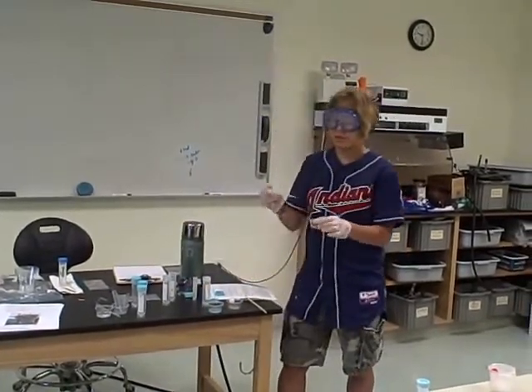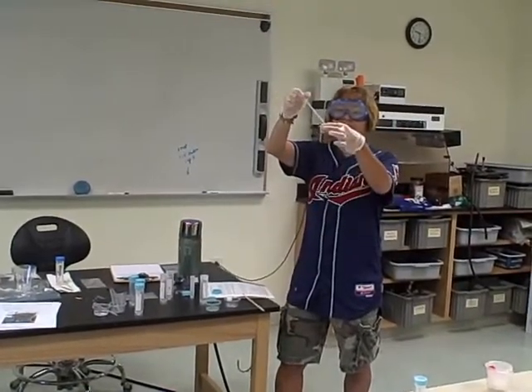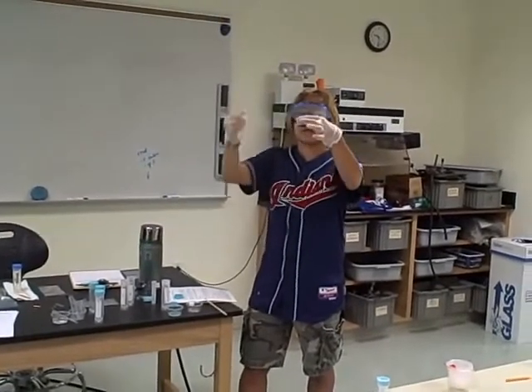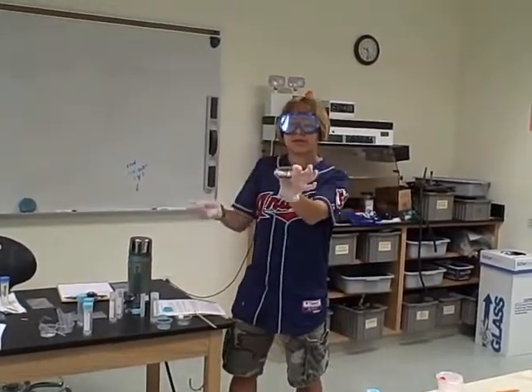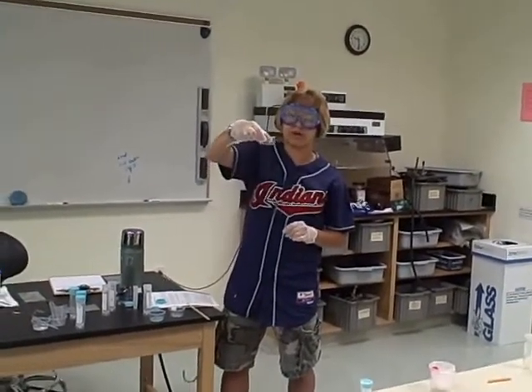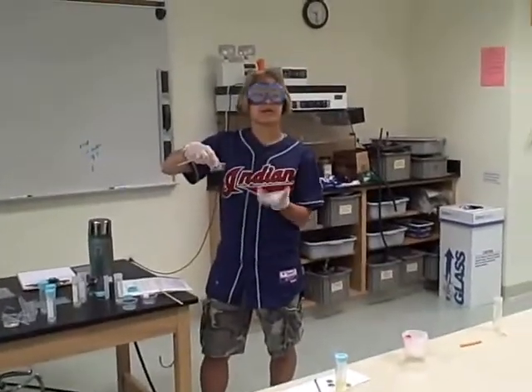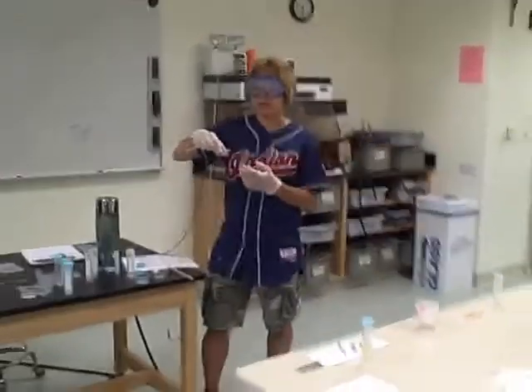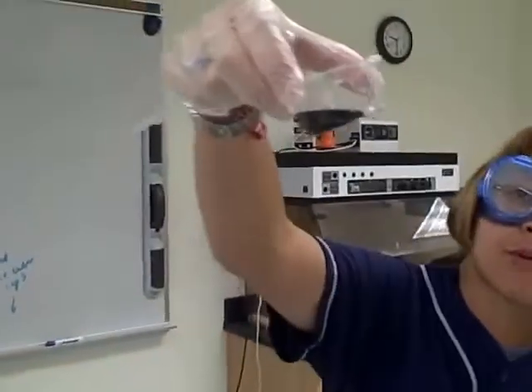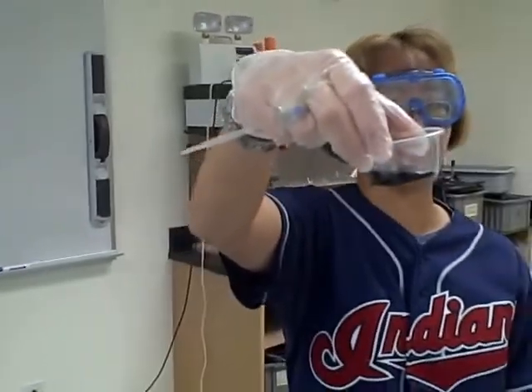You're going to take your cup number 11, essentially add whatever number of drops starts to give a color change. In this case, it will probably only be 1 or 2. What's illustrated here is a lot of fizzing, because again, what you're doing is reducing water. But what's happened is the pink has gone to black, essentially because cobalt 2 has been reduced to cobalt 1. What you may not be able to see real obviously, so you'll want to kind of show this to the students.